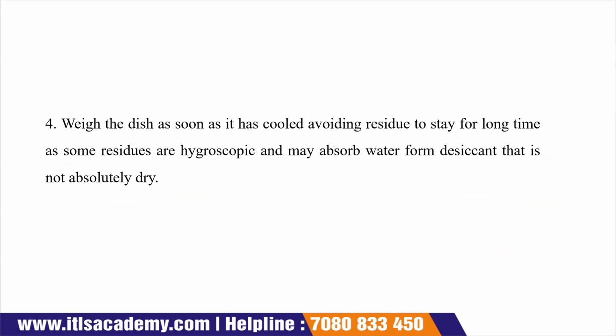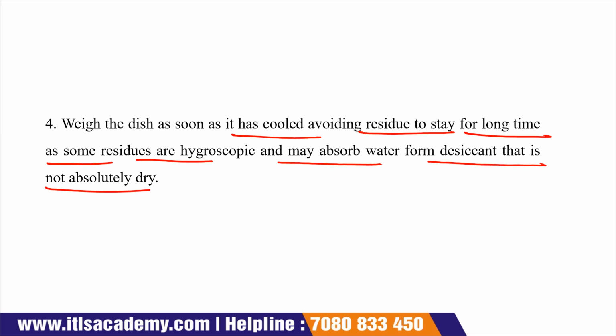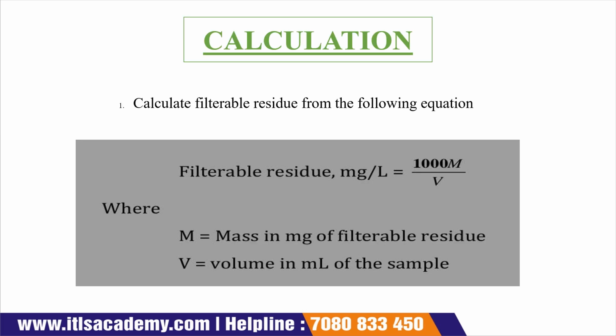Now weigh the dish as soon as it is cool. Avoid letting the residue stay for a long time, as some residues are hygroscopic and may absorb water from a desiccant that is not absolutely dry. Okay, so we have to take one precaution here. We have to weigh the dish as soon as it is cool, so that it will avoid the absorption of water, because some residues are hygroscopic in nature. Now the next one is the calculation part.